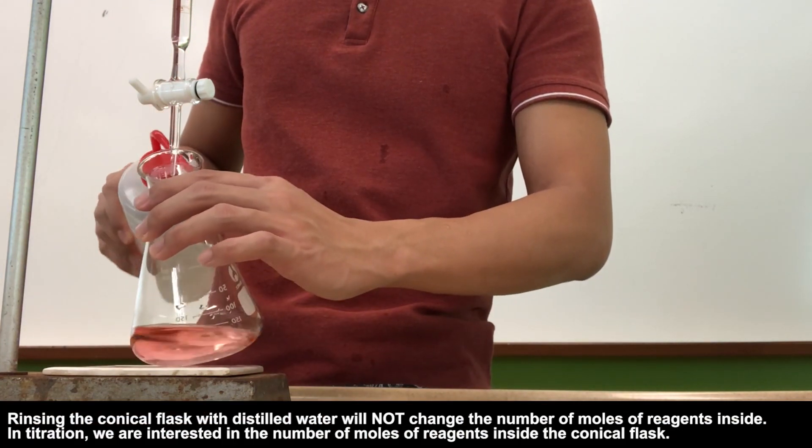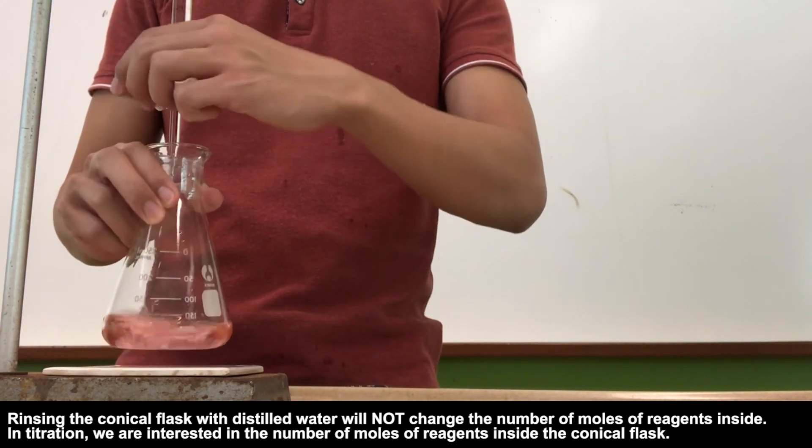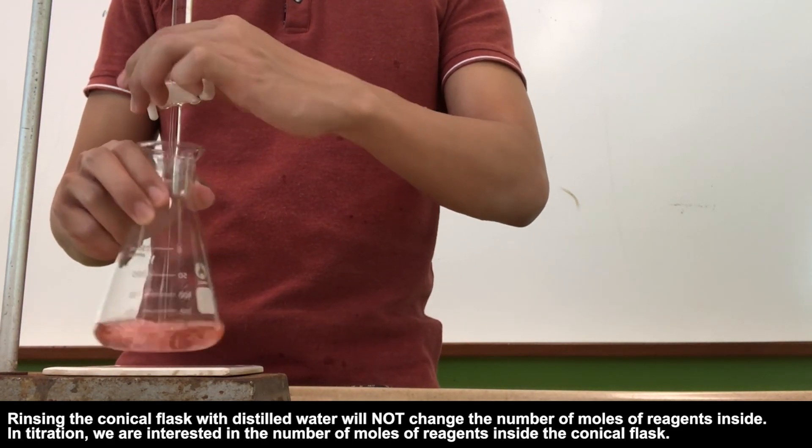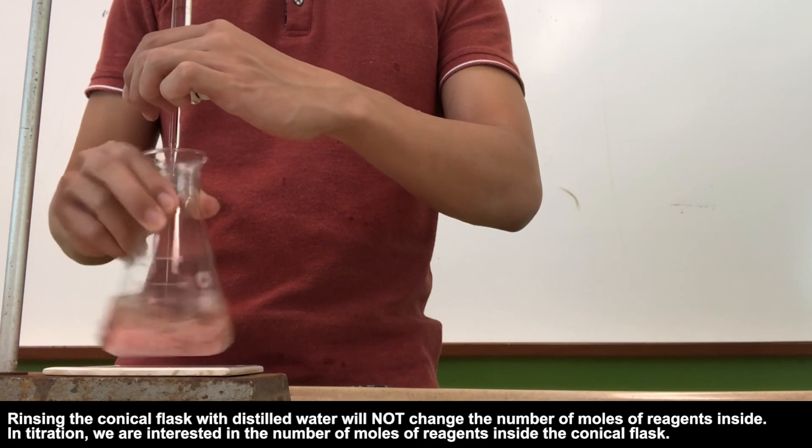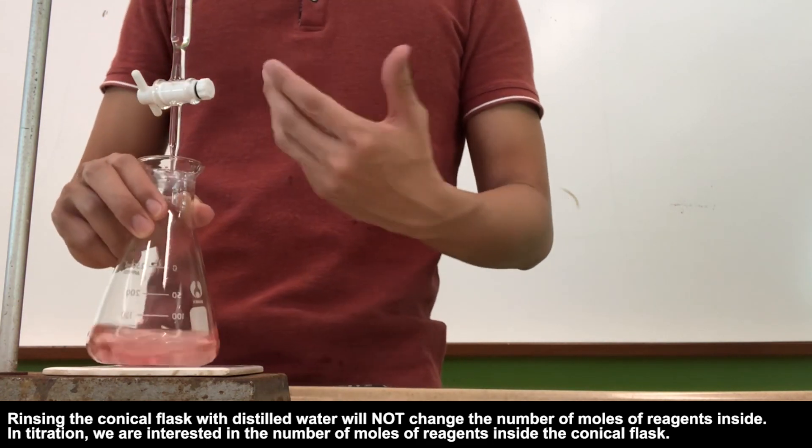If some of the solution were to be splashing onto the side of the conical flask, not to worry. Like what I mentioned, rinse it with distilled water. The total number of moles of chemicals did not change, so it really doesn't matter when the distilled water is being added in. So not to worry too much about it.